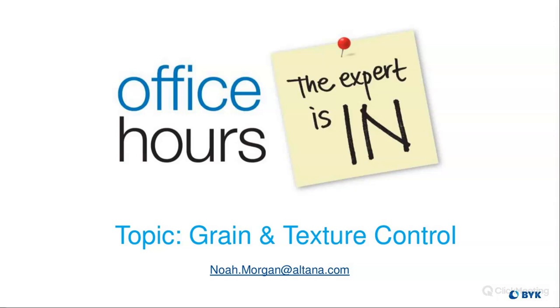Let's see, another question. Do you see any issue measuring surfaces other than leather with smaller imperfections? Yes, so I don't see any issue with it. It really depends on what you're looking for. I have some applications where people have used this instrument to look for imperfections on surfaces. Because with that 3D topography data, you can really see a zoomed in version of what you're looking at from a distance. It's a great question. I'd love to hear about the application, so feel free to shoot me an email. We can talk more about it.